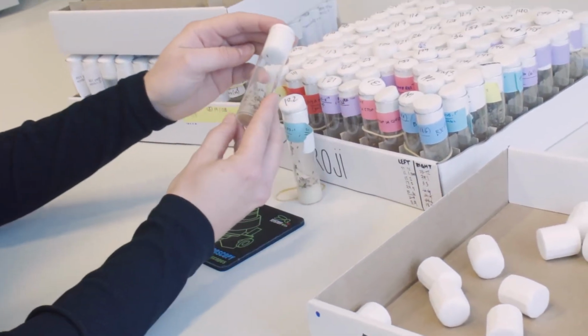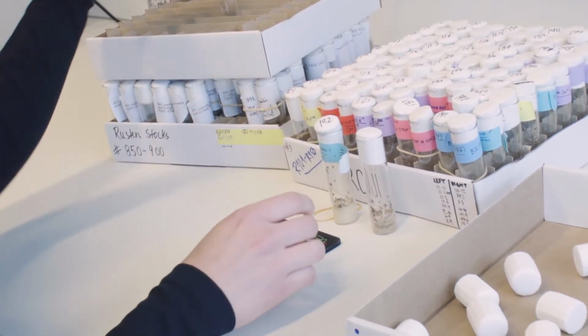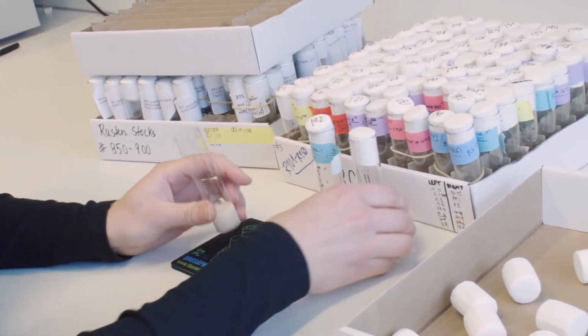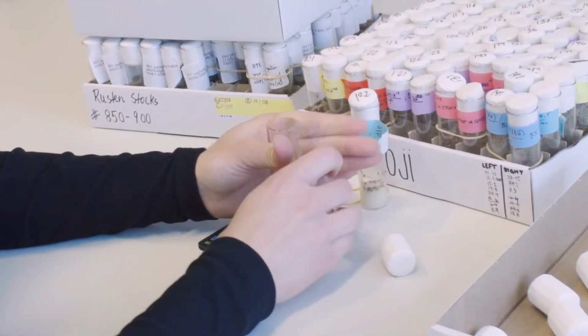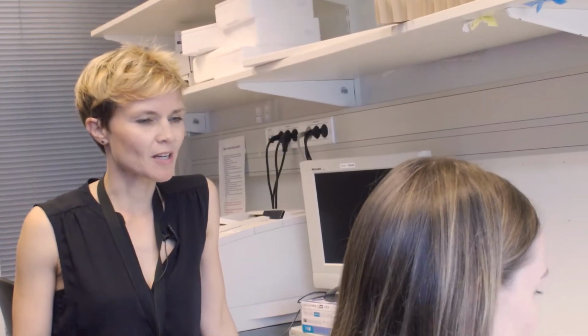When the flies need new food, because it is old, then we just take a new vial with new food, and then we flip them over into the new vial. So the adult flies go into this vial. The tapping that you're doing, tell us what the role of that is.